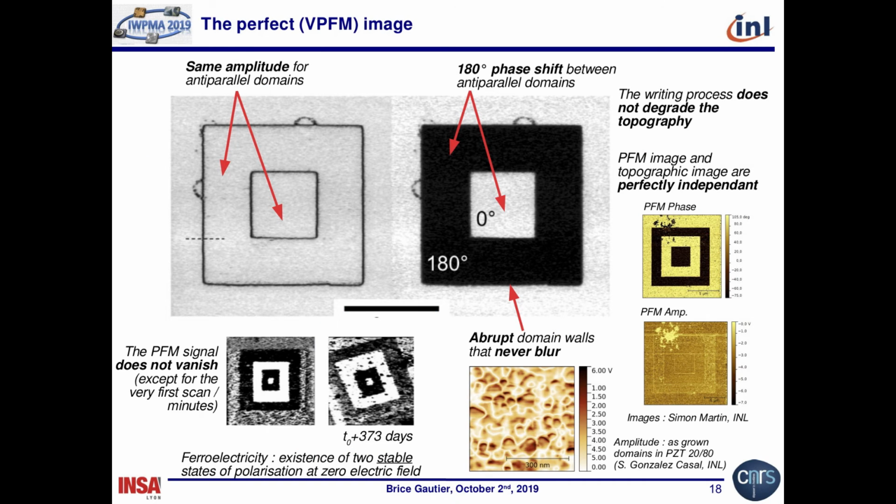Okay, we'll talk about artifacts later. If we want to talk about artifacts, we have to have in mind the perfect PFM image, which will be the reference. Any deviation from this ideal situation will be a clue that something is going wrong with the sample. So this is a perfect image.